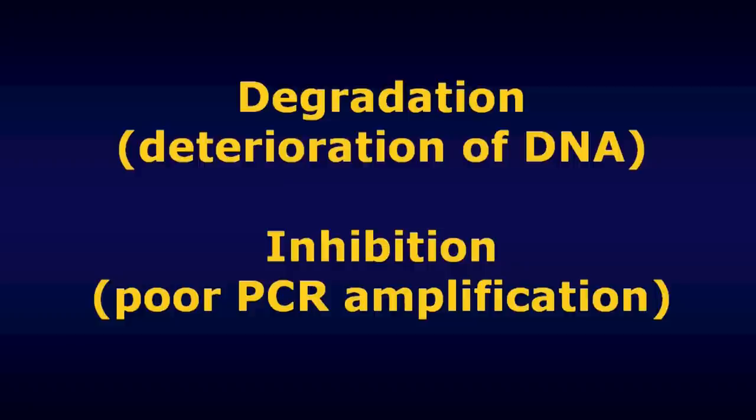It gets degraded, right? In some sense, we're starting to talk about the digestion or the deterioration of a DNA molecule. When that happens, when DNA molecules get damaged, they can't be amplified through that PCR amplification process, and they can't contribute to the electropherograms, or at least not as much as they could have before that damage or deterioration had occurred. Right? So degradation gives rise to peak heights on electropherograms that are smaller than they would have been if the material had not been degraded.